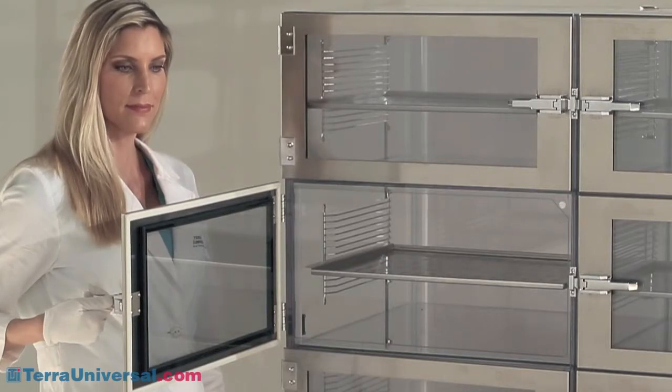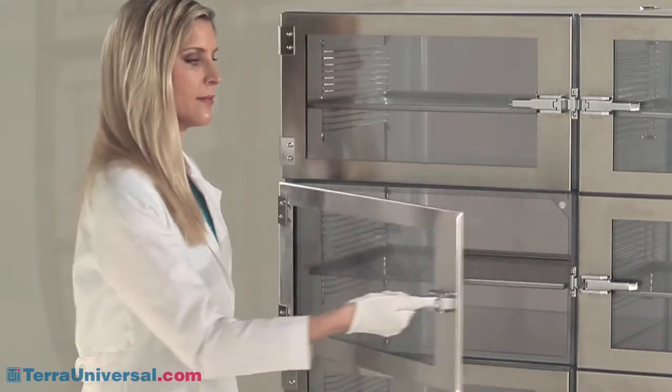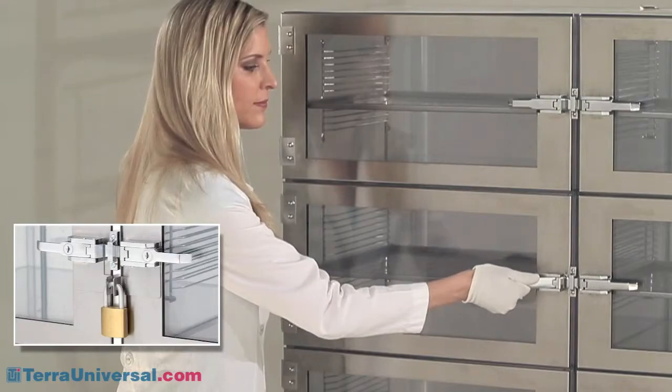By eliminating the chrome finish, stainless steel latches prevent flaking, corrosion, and contamination that can result over time with chrome-plated models. Latches can also be specified with security locks.